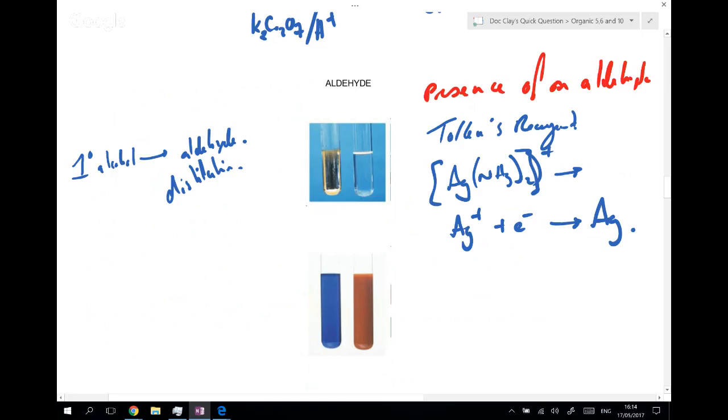You do need to know how to make up the silver nitrate solution for AQA. That's one of the requirements that they ask us to do. So I'm just trying to remember. Certainly, that's something that's going to come up in your paper 3. It could come up, but potentially it could also come up here in your paper 2. It's a practical test, so I would expect to see it there in your paper 3, if it's going to come up anyway.